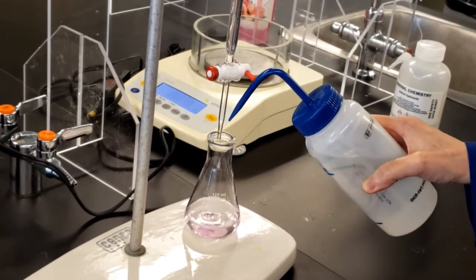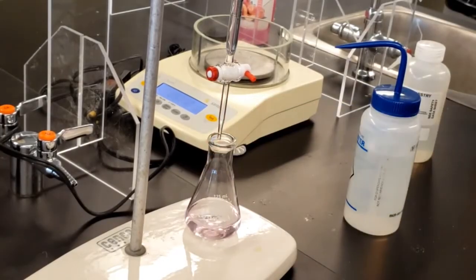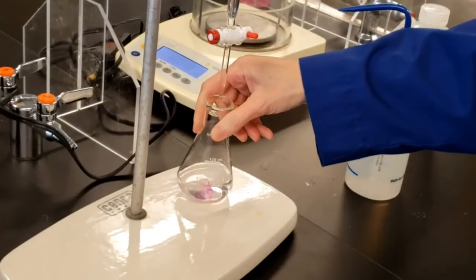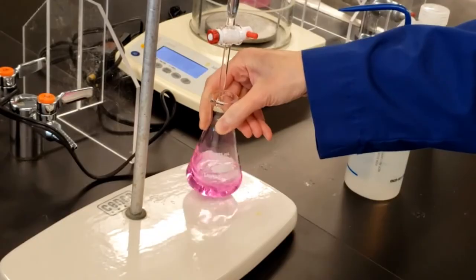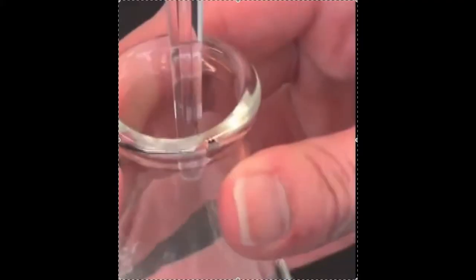If you are unsure if you have reached the endpoint and you want to add another drop, be sure to take note of the burette reading. Your next drop may not be necessary. If your drop turns the color a deep pink, you have added too much titrant and are now past the endpoint. You may also rinse the tip of the burette or touch the burette tip to your flask when you are near the endpoint to add a small amount of titrant as previously described. This may be enough to reach the endpoint.